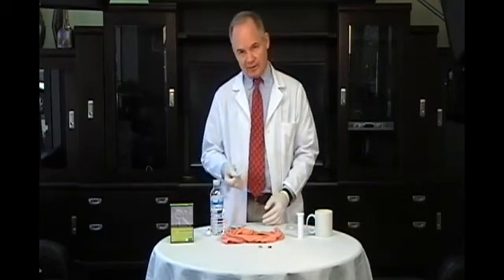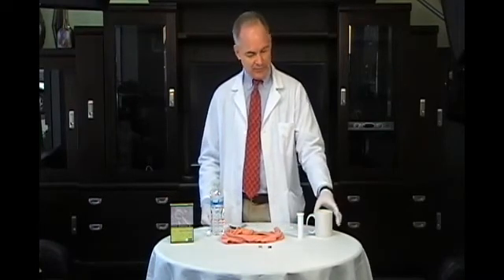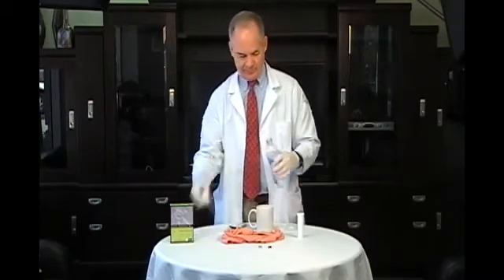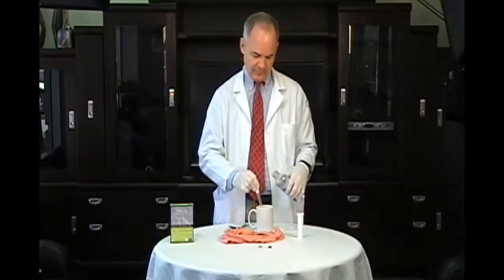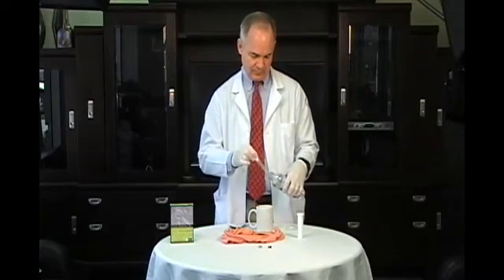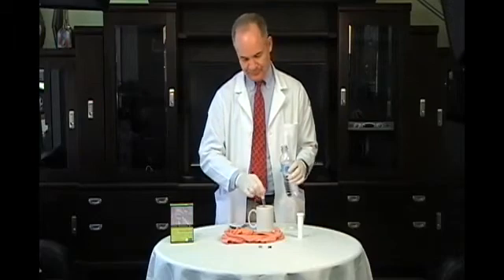These test strips come in these pouches right here. The procedure is to put 15 mils of water into a coffee cup, like this. Five, 10, 15.